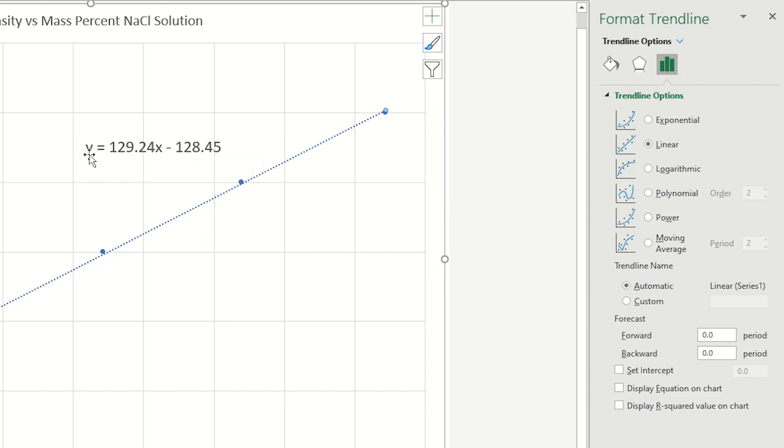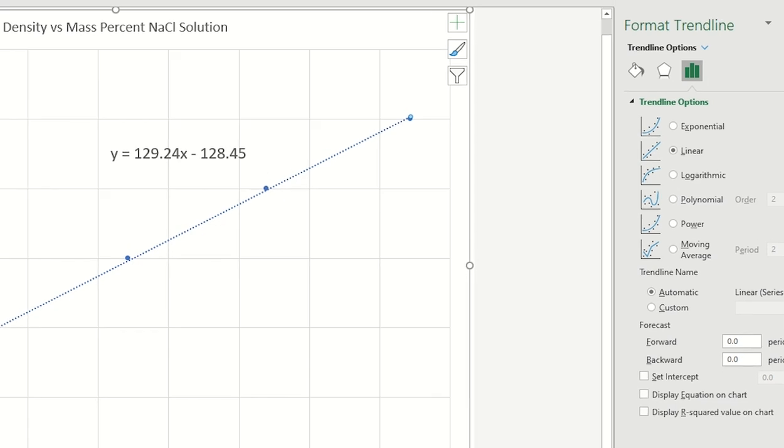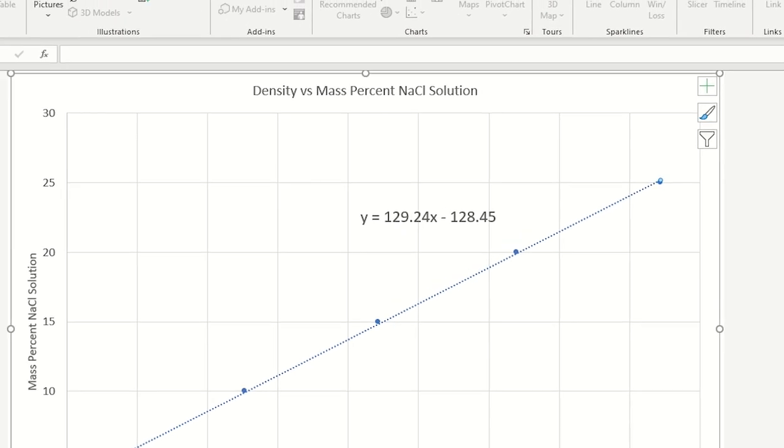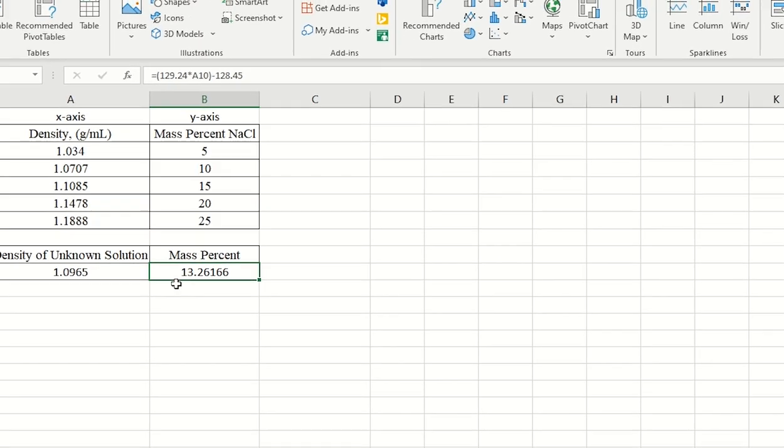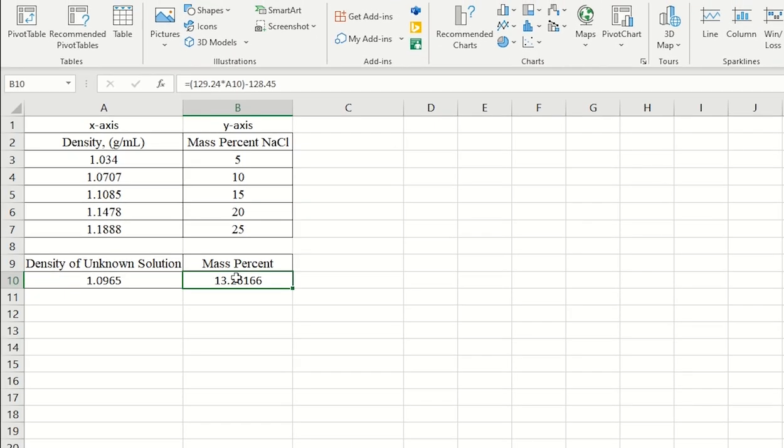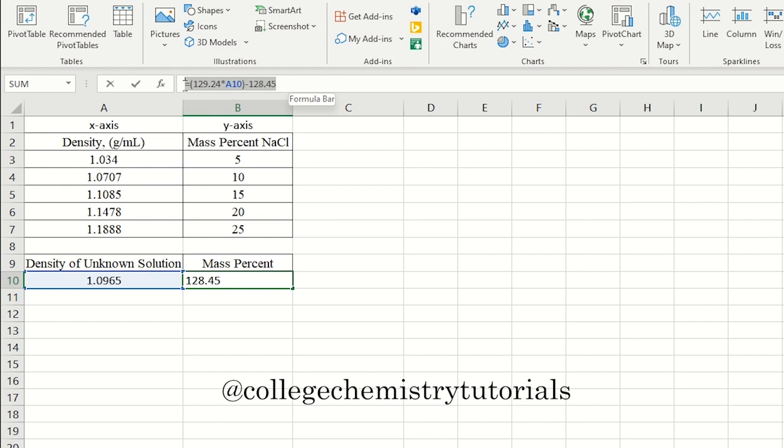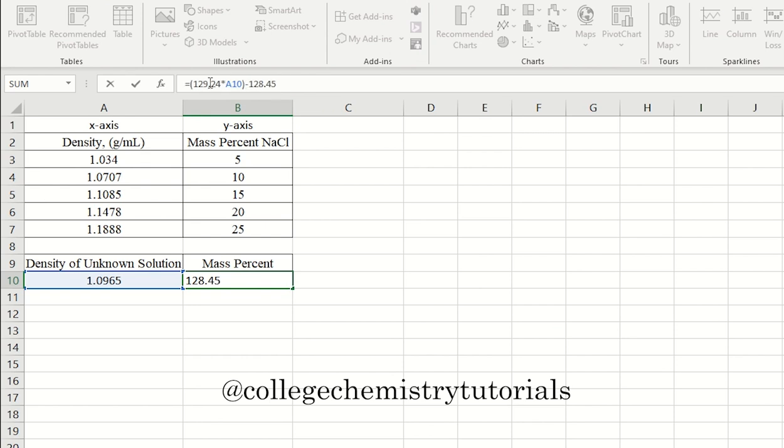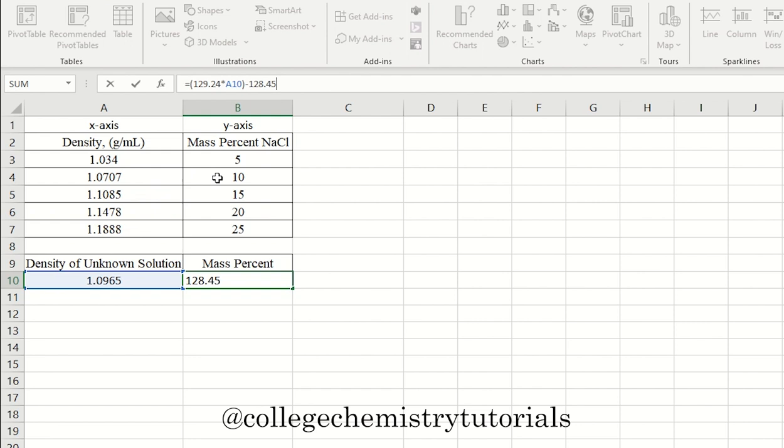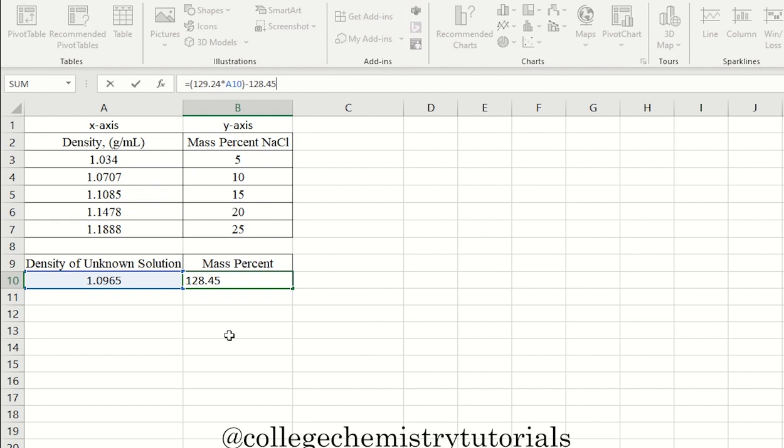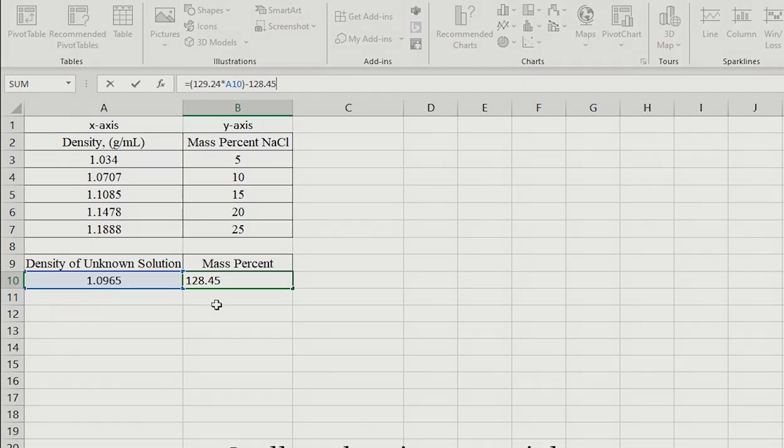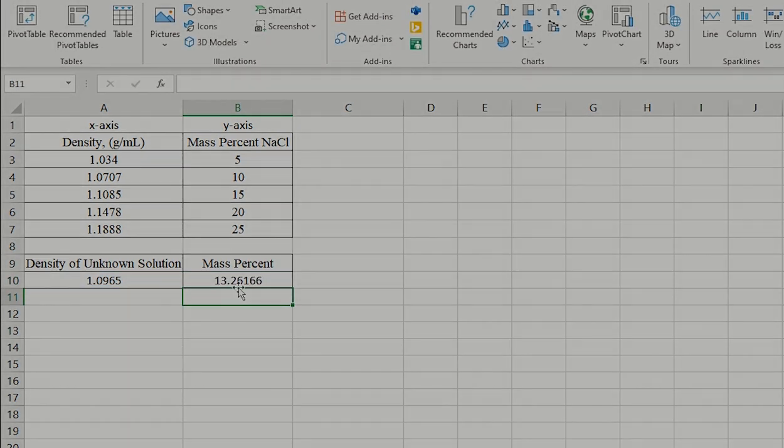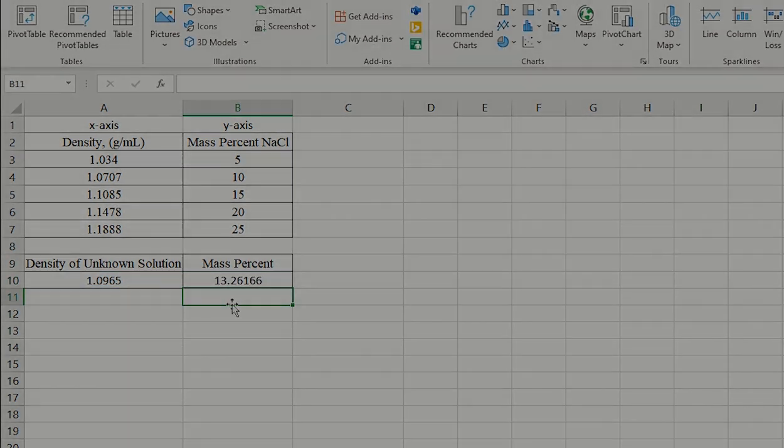I want to calculate Y. What is the mass percent when I plug in an X or a density from my experiment? So I copied this equation, went to the mass percent. And here's my equation. So it's the 129 times X. X is my density that I get from the experiment for the unknown solution. And this is going to give me my mass percent for that unknown.